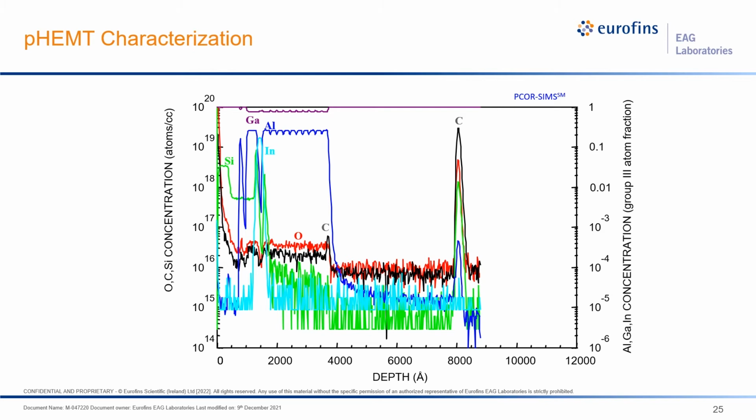are looking at with SIMS. It's the epitaxial and substrate interface impurities. The concentrations of these are proportional to the leakage current, so you want to have better control, better concentration measurements, and obviously the need to minimize them as much as possible.